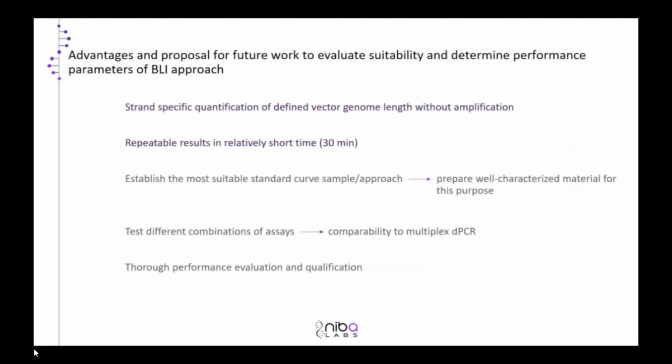And the advantages are definitely the strand-specific quantification of, let's say, any kind of defined vector genome length without amplification. So it's really almost like going directly into the sample, not amplifying DNA. We have quite repeatable results in relatively short time. So the shortest time to result is 30 minutes.